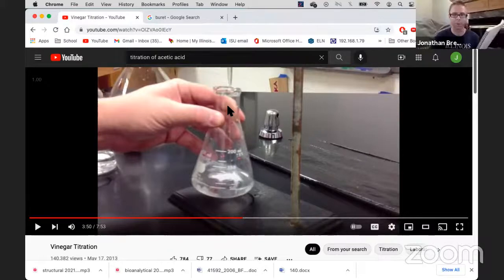And I don't have to worry about, oh my goodness, is this going to affect my grade? We just threw out the first practice run. And then you'll know about how much to add. And then we need 3 good data sets though. So if you are throwing out the first run, just realize you automatically know that you have to do this 4 times. You need 3 good data sets.